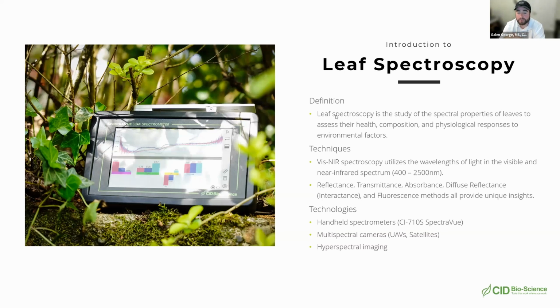The next question is, after how much time of fertilizer application can the data regarding leaf contents or nutrition be recorded? This really depends on what type of fertilizer is being applied and how it's being applied. Like I mentioned before, any kind of extra moisture on the leaves is going to cause problems. If you just applied fertilizer and it was sprayed and it's on the leaves in any way, that's going to alter your spectra slightly. So you want to give it appropriate time to not be taking scans that could potentially have direct layers of any kind of fertilizer on a leaf.